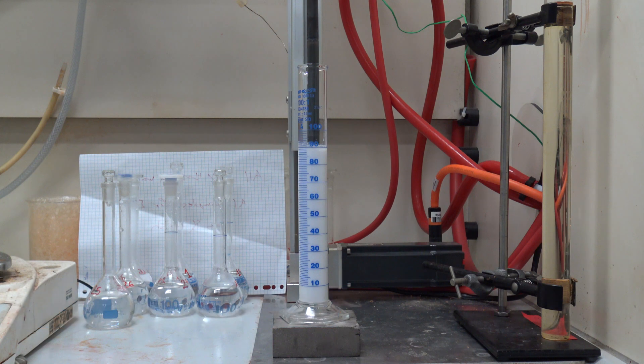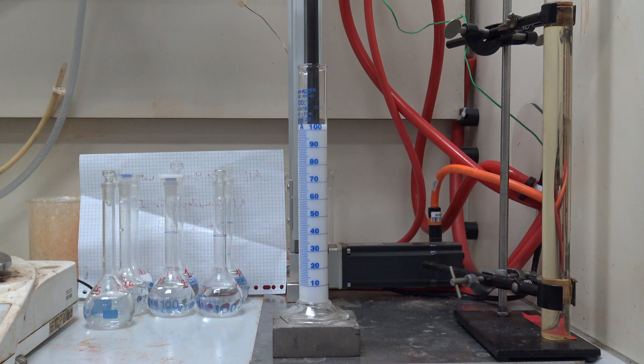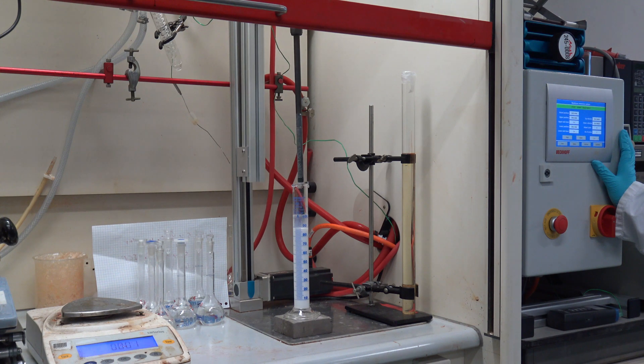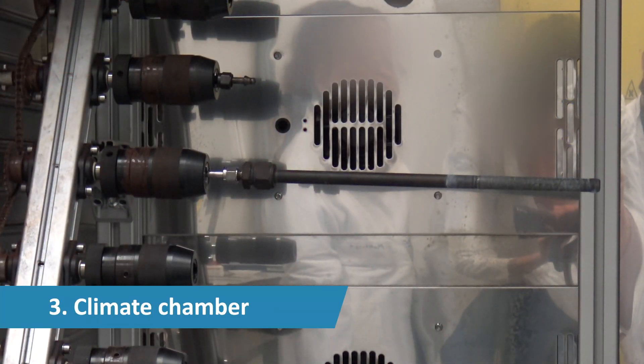To prevent diffusion of palladium into the metallic support, a ceramic layer needs to be deposited between the support and the selective palladium layer. This is done by dip coating the support in a dispersion of boehmite and various other additives.